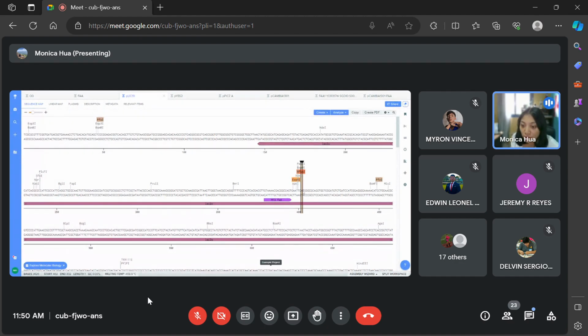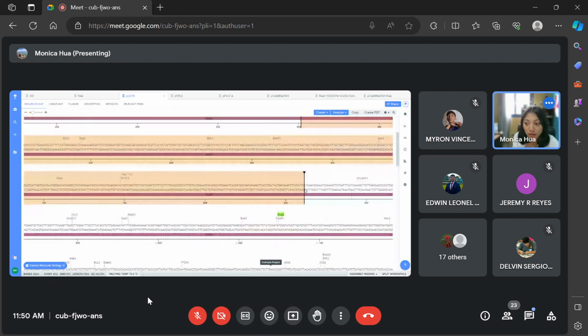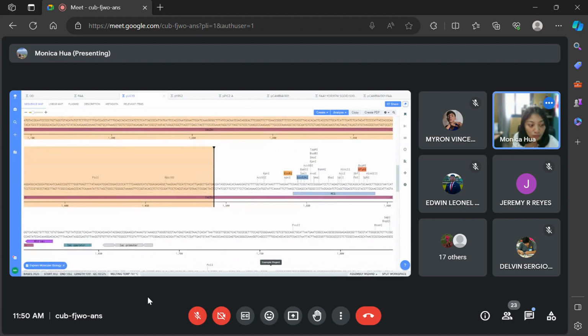You're going to copy your sequence after your restriction enzyme. It starts from ATG, so it should go to, where is the end of my other sequence? Where's my EcoR1? Somewhere here. Okay, TAA.